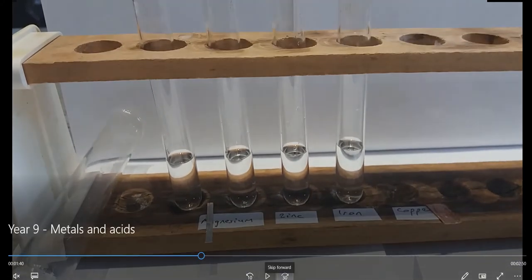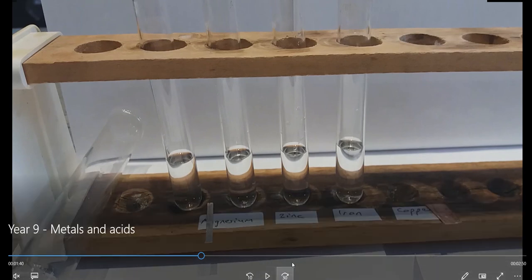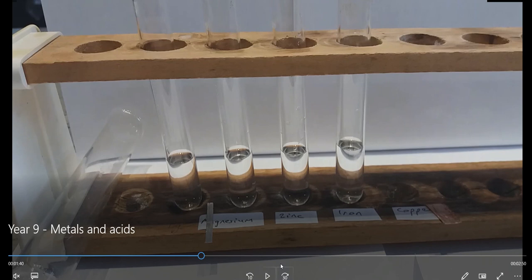Okay, so the lump didn't react very quickly. So what I'm going to do is set up 4 experiments just to compare the 4 metals that we've got there. So you'll see in the video we've got magnesium, zinc, iron, and copper. And I'm going to drop the metals in. Now for the zinc and iron to react very well, we need a slightly faster reaction than we showed in the first one. So we're going to drop a little bit of powder in, and that really shows in a good way a comparison of the reaction. So let's do magnesium first.